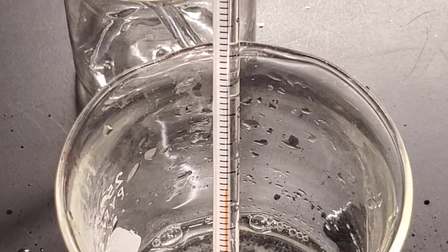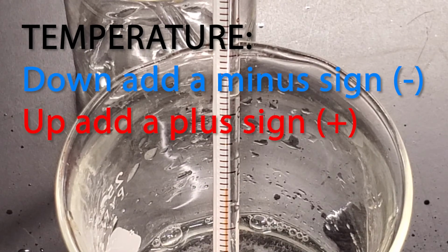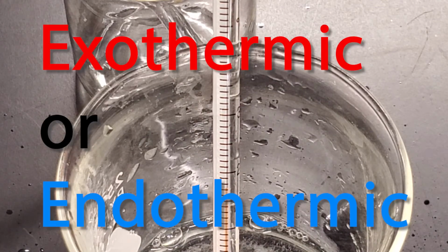Now, as we are finishing up and going to clean up, we want to make sure that on our table 2, we go ahead and take the difference. We're going to subtract the 2 numbers. If the temperature went down, you should put a minus sign in front of your number. If the temperature increased and got warmer, you want to put a plus sign. Make sure you finish out any observations that you made. You're going to separate all of these reactions into one of 2 columns, either exothermic or endothermic, depending on how the energy was either released or absorbed.